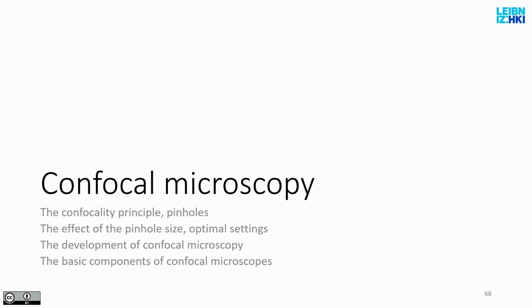You live with the fact that if you take a series of images along the optical axis, a so-called Z-stack, each of these images will have a lot of blurred components because of the out of focus light, but then I run my deconvolution on it, and I have a nice, relatively sharp Z-stack of an image. This works perfectly well. It's a cheap solution. There is nothing wrong with it. A lot of biology labs here use the same method, like the image I showed you, which we are working on at the moment in a concrete project.